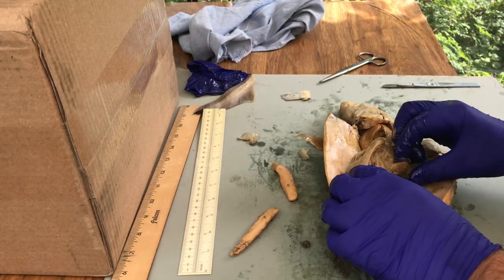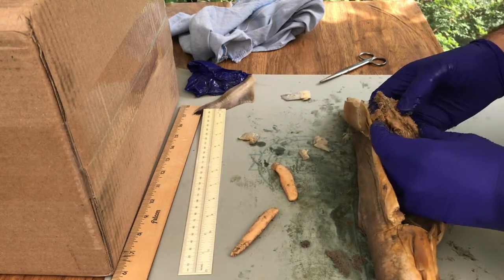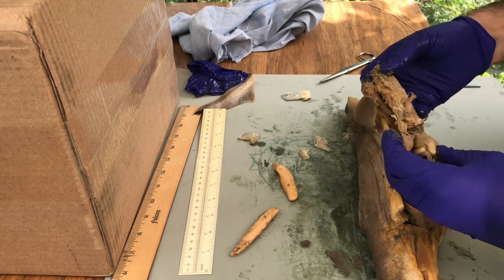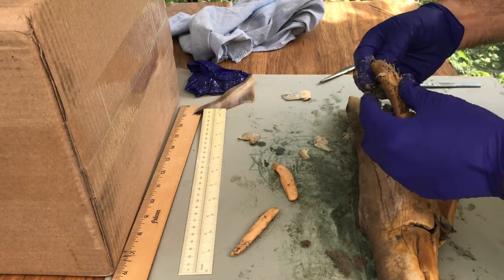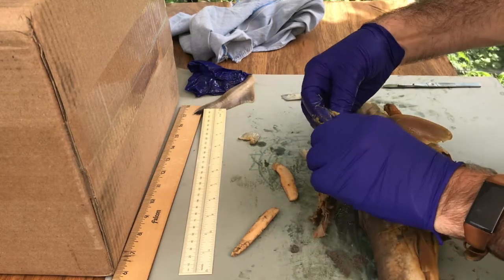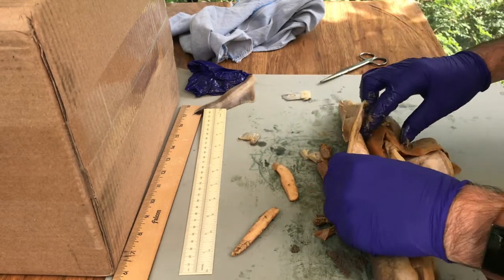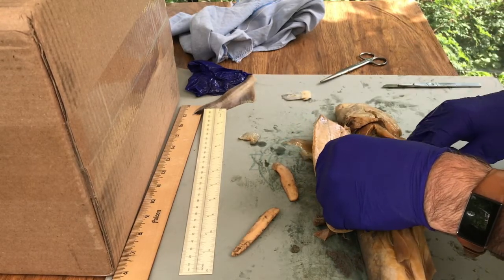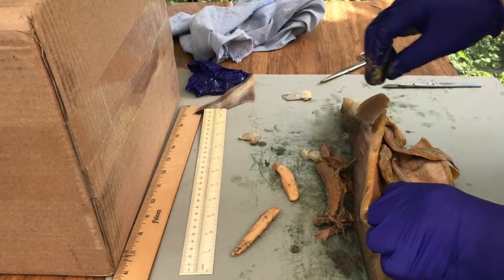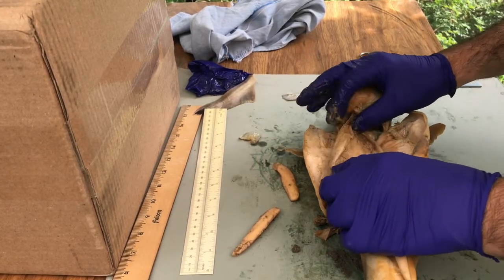Let's see what we've got here. Looks like something very fishy. You see the vertebral column of the fish and all the bones spreading off to the side. So it looked like it was two, or felt like it was two, but maybe it's just one that had already split a little bit. A little hard to tell what it is. There's no head left, but that's definitely the muscle of a fish. And that's about it. There's a little bit down at the tail end there, but I think that's also a little bit left of whatever the fish was. Well, that's kind of interesting. It almost filled that entire stomach area.